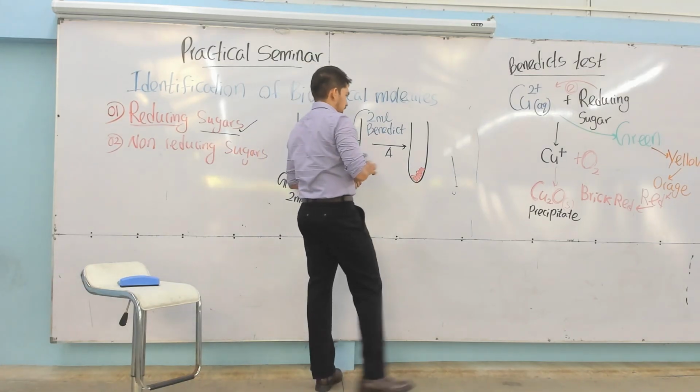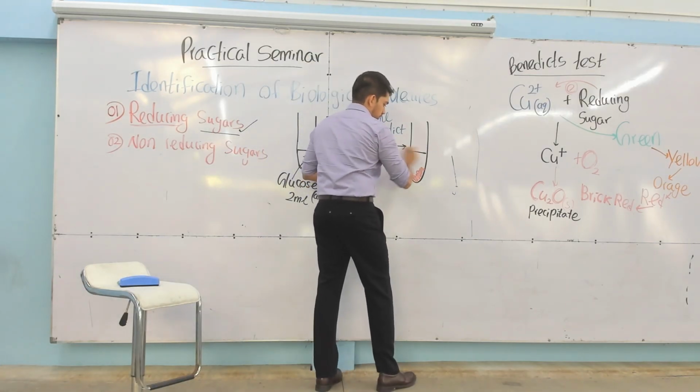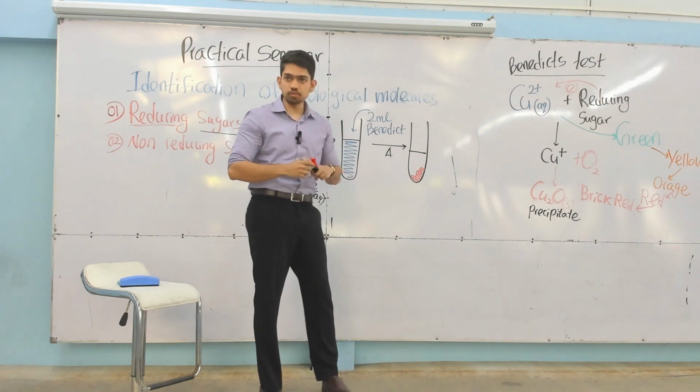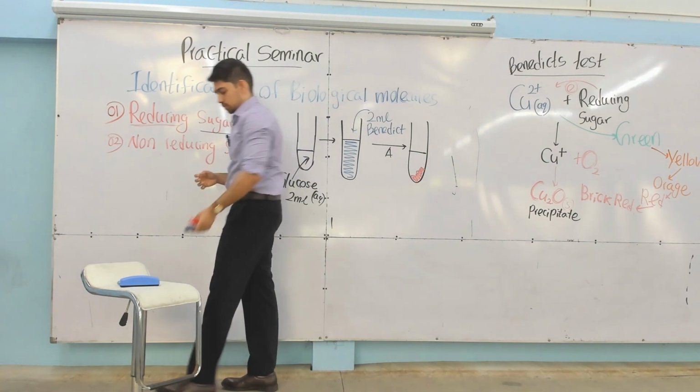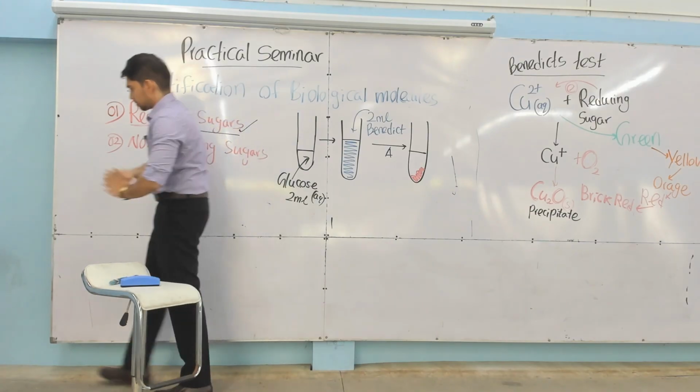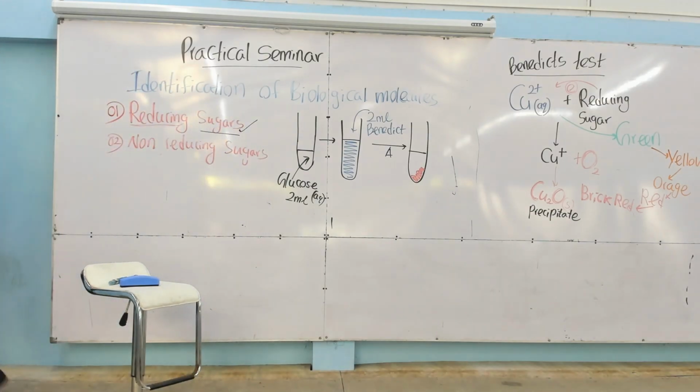Okay, the solution is there. Aqueous solution, right? In that solution, you are going to get a precipitate. Okay, this is the practical. So let's try this.